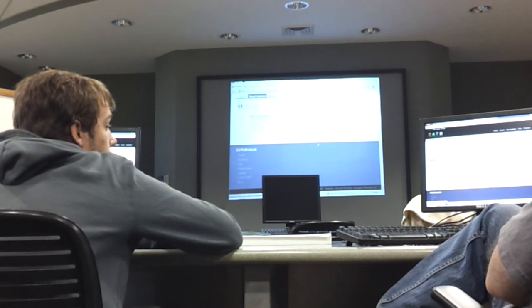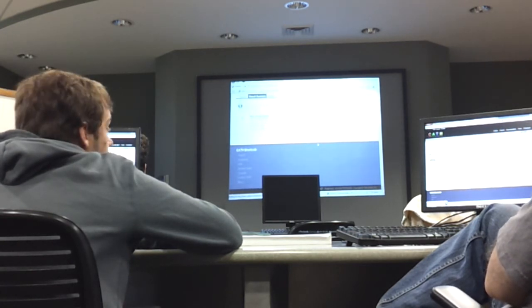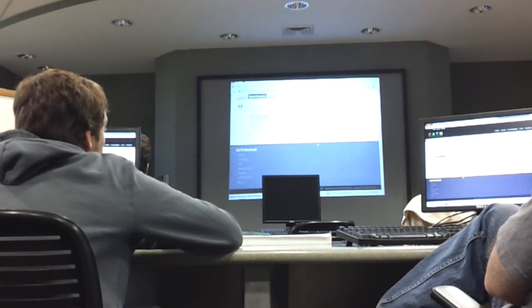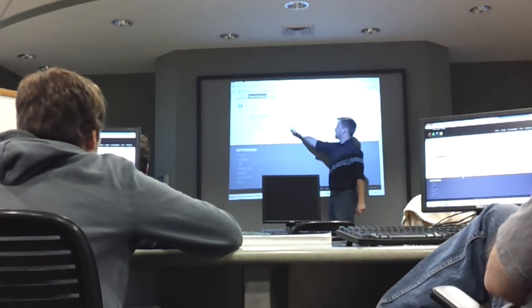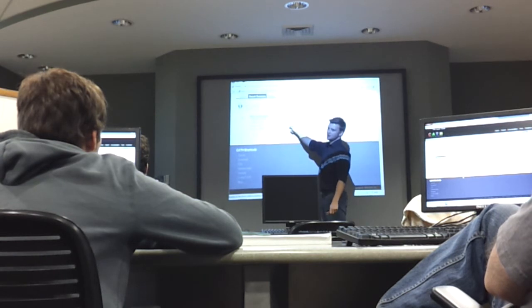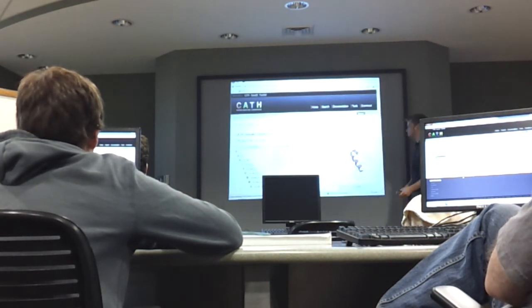Well, you used the human one, right? Correct. And I used Octodon degus, and I got the exact same domain result that you did. So it didn't matter which species we used. Just narrow it down. Those numbers: this is class, this is architecture, this is topology, and that is homologous superfamily. And it'll show up like this.